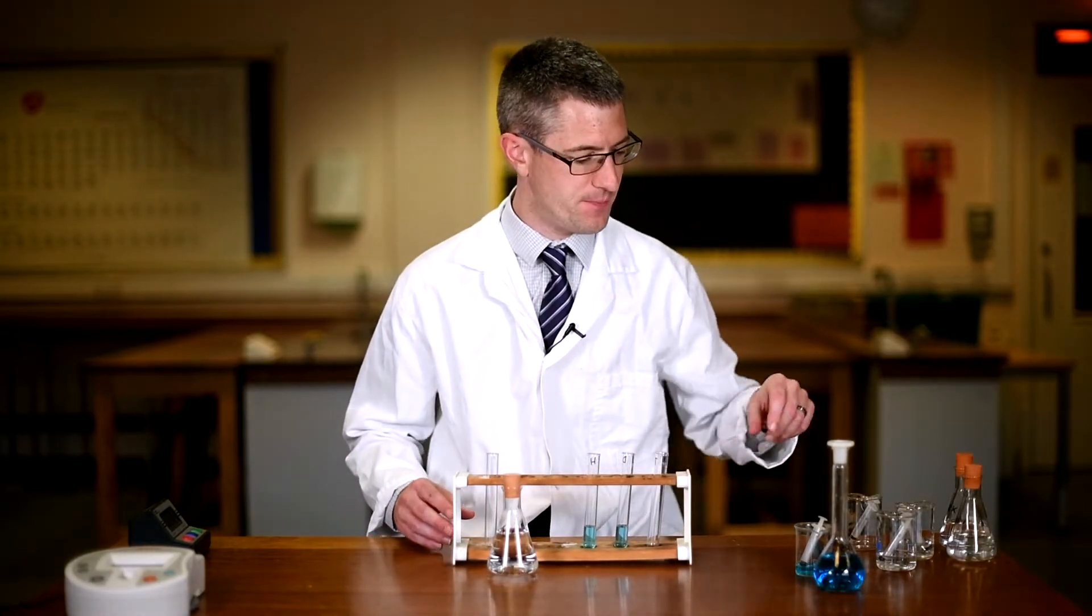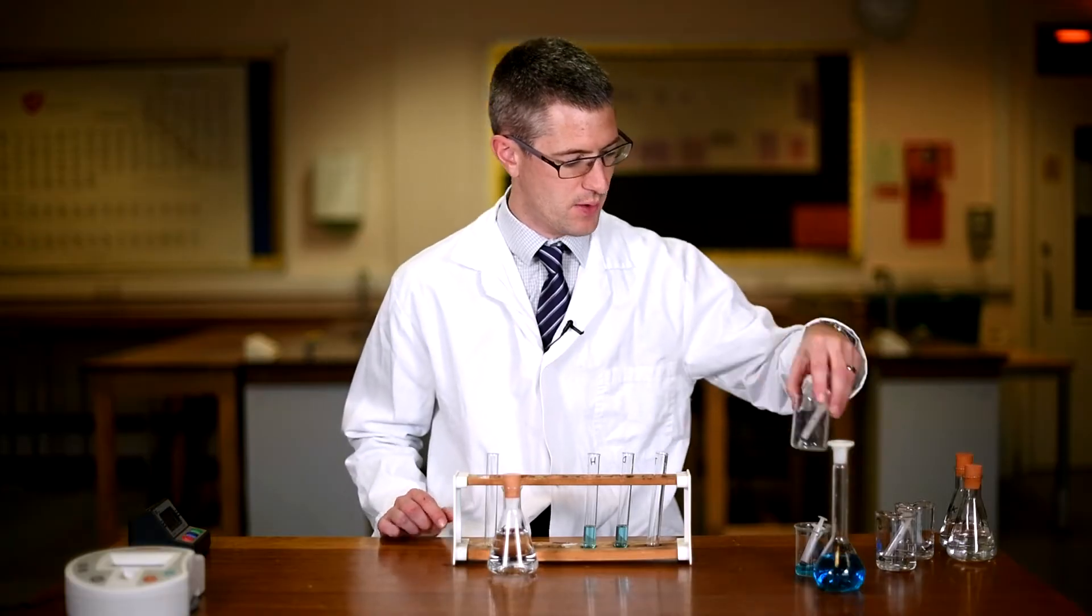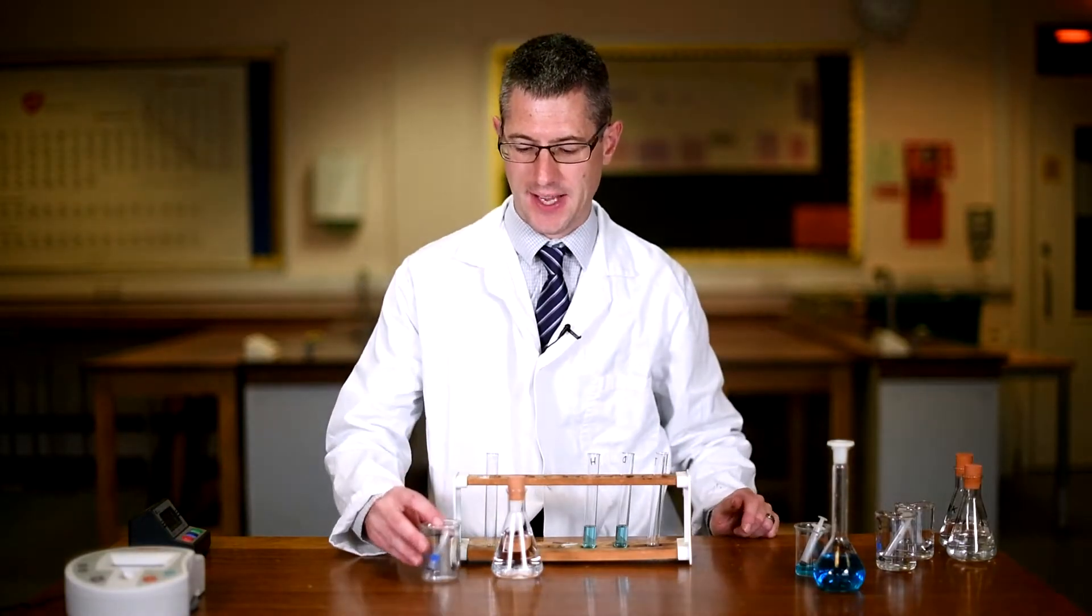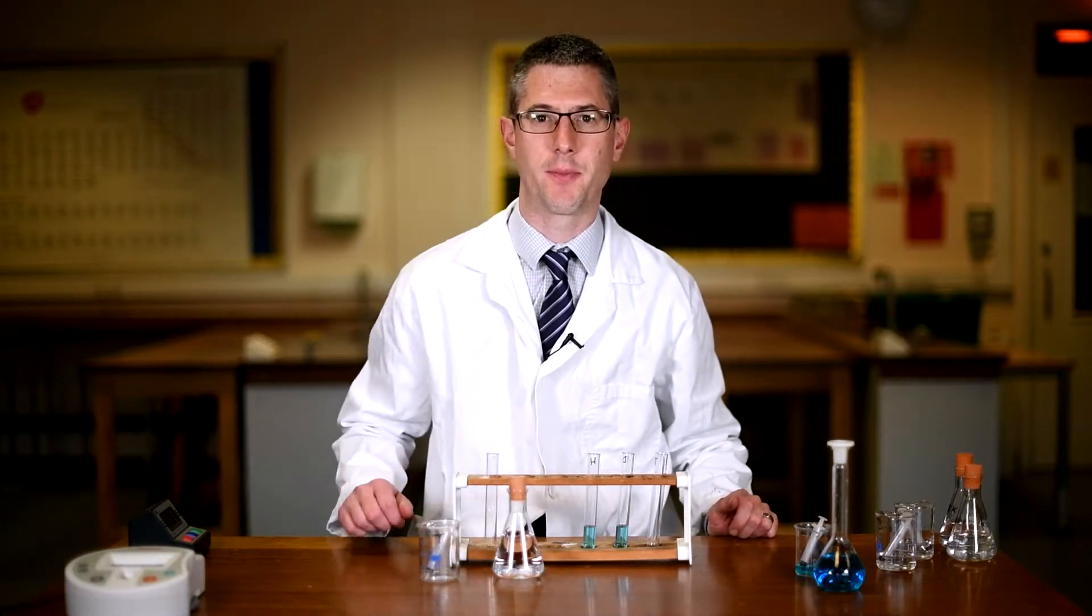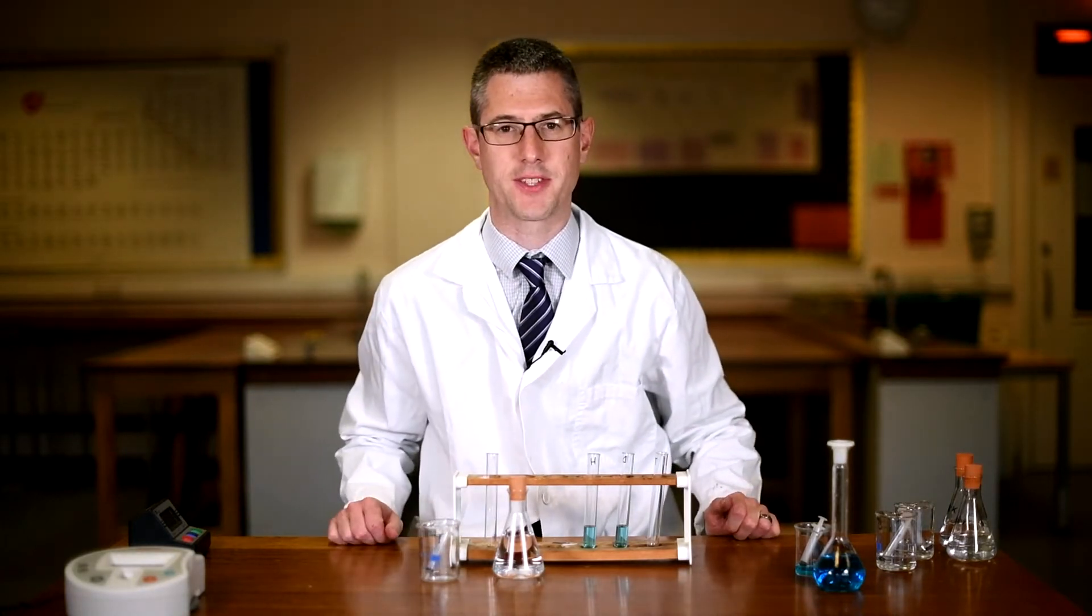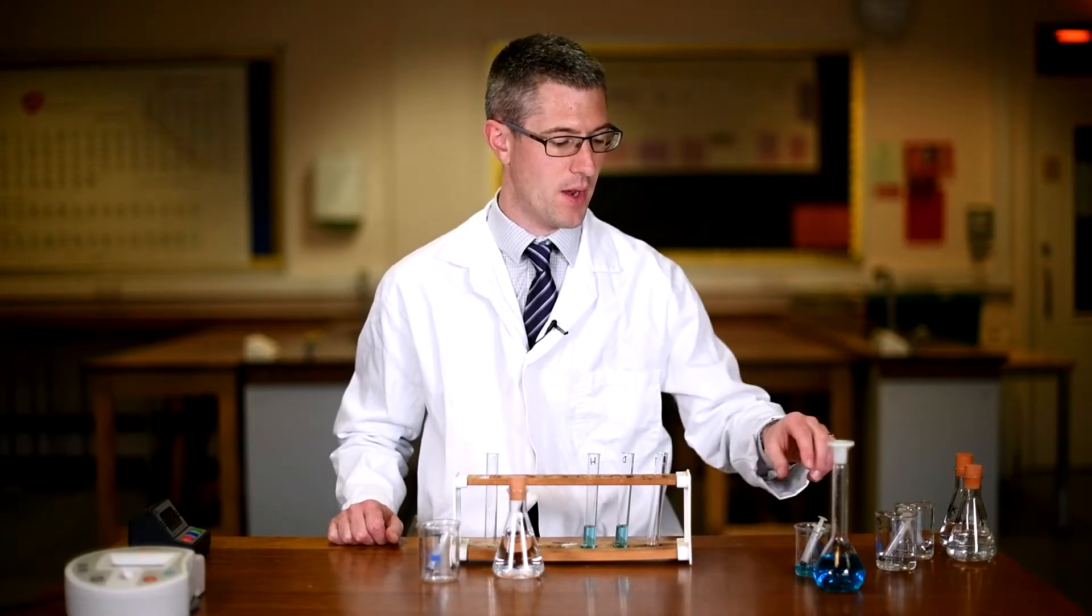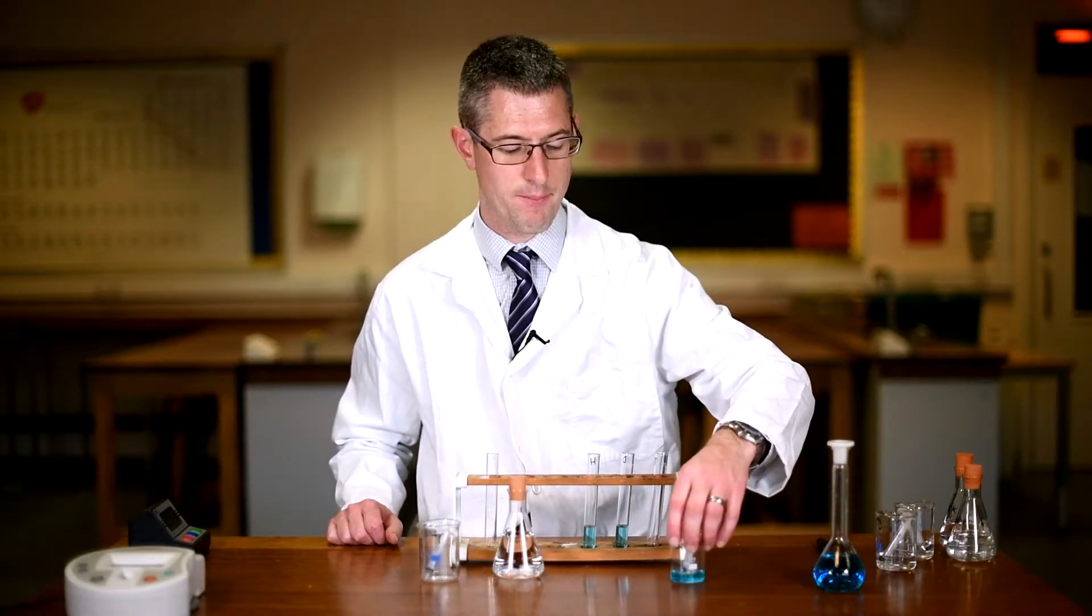We need a test tube, a beaker so that we can easily get hold of our urine and decant it from the conical flask into the beaker so we can then measure it out with a syringe for accurate measurements of two milliliters. We also need some Benedict solution.